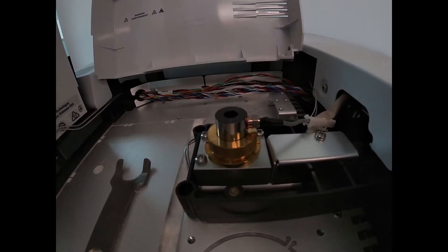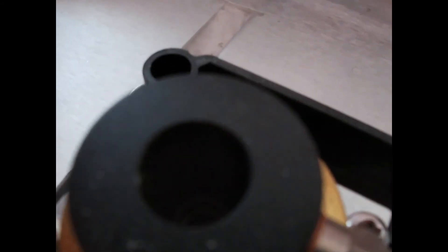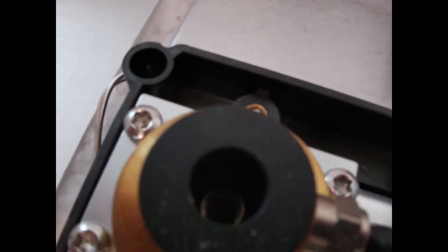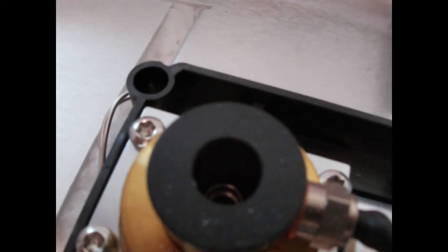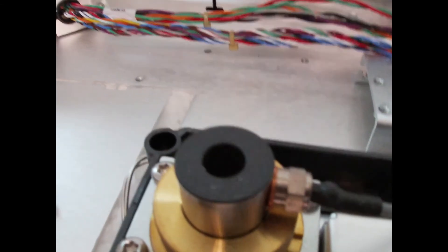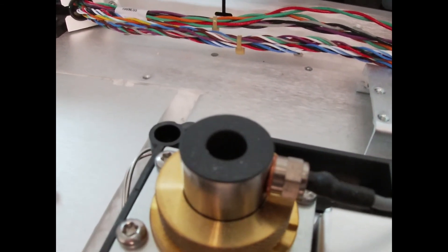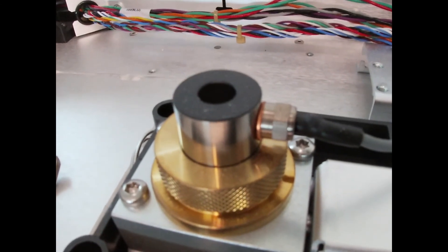And so as we flow out of the column we enter our flame ionization detector which is right here. So our flame ionization detector, we've got a little cone down inside there. The lighting is not great so I'm not sure that you can actually see it and there's an igniter coil. And so when we light our flame, our hydrogen flame in there, the sample flows out, it hits the flame.